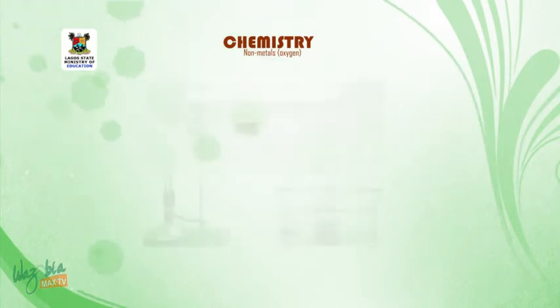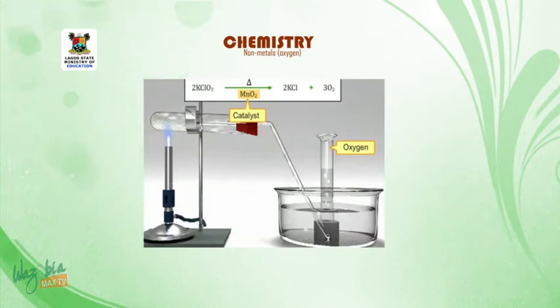KClO3. In the setup for the preparation of oxygen, we have a boiling tube supported by a retort stand, a source of heat, a delivery tube fitted in a cork in the boiling tube. Then you also have a pneumatic trough containing the beehive shelf and the gas jar.